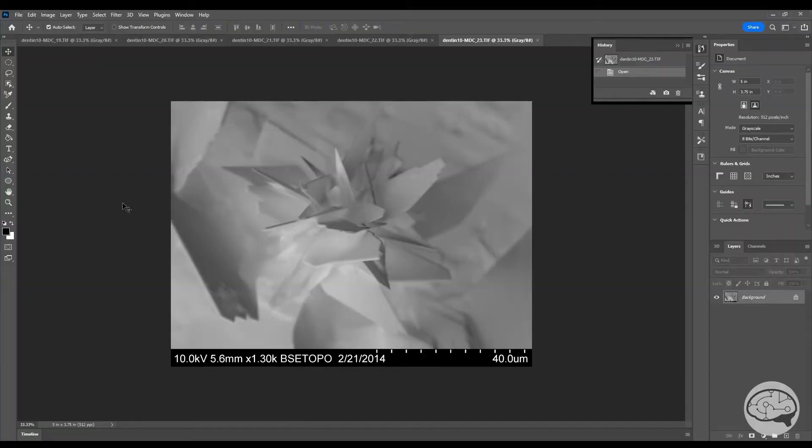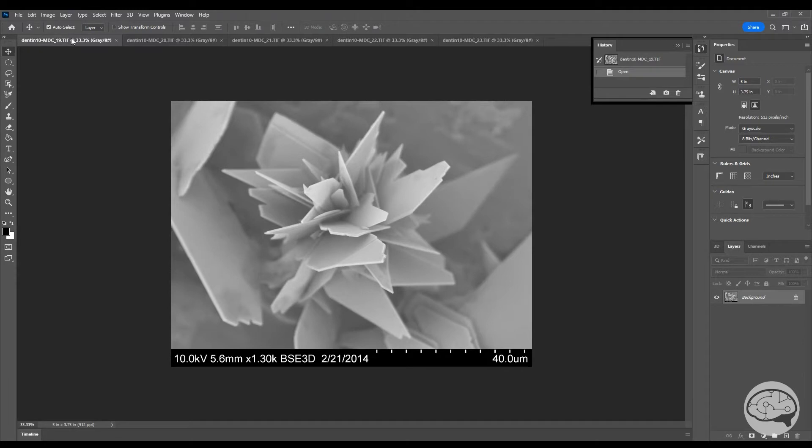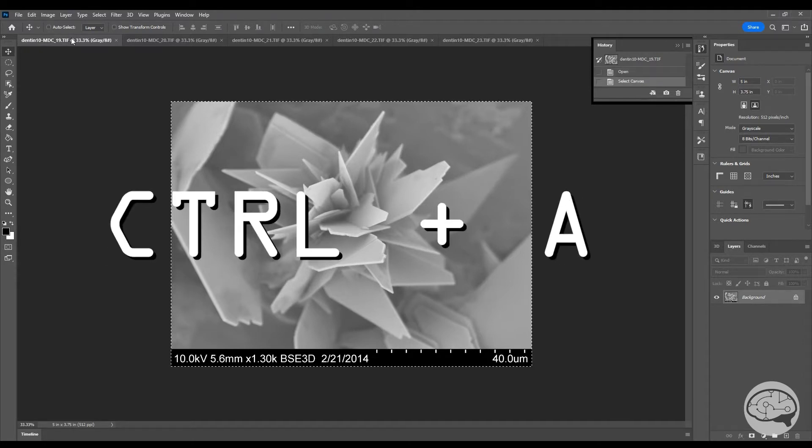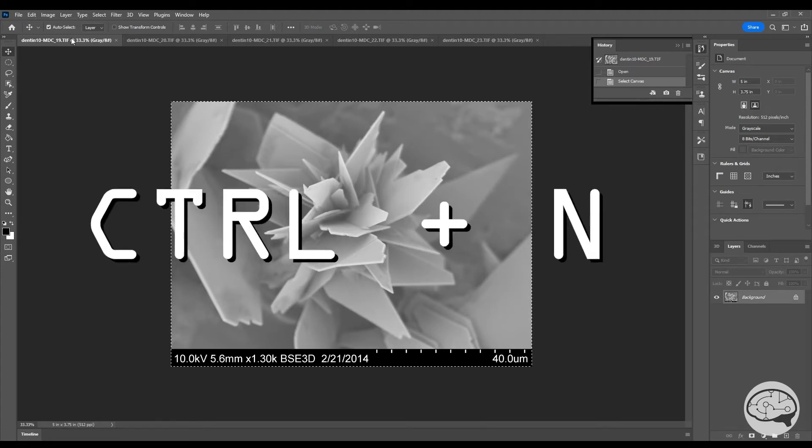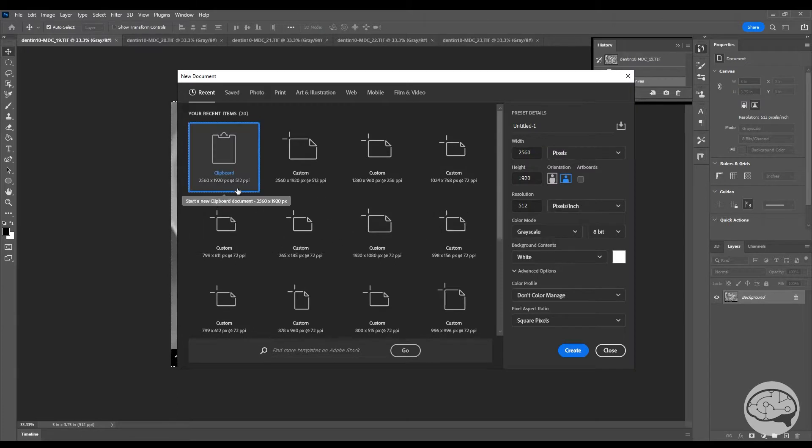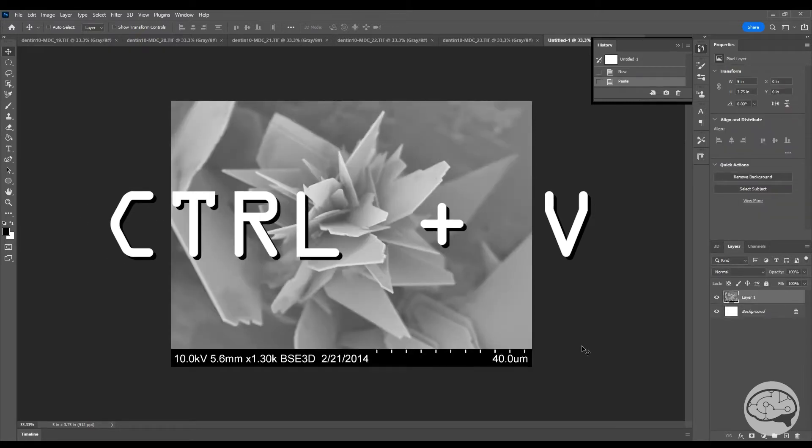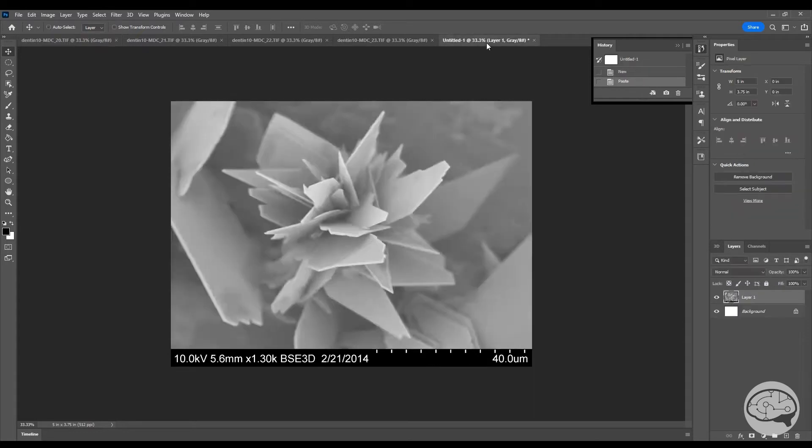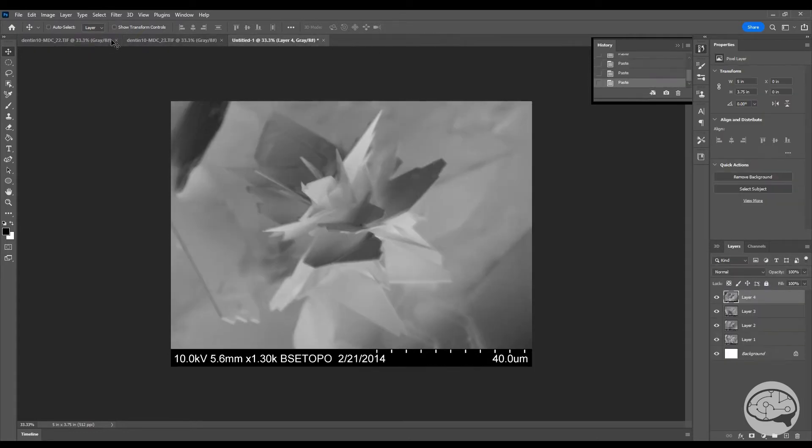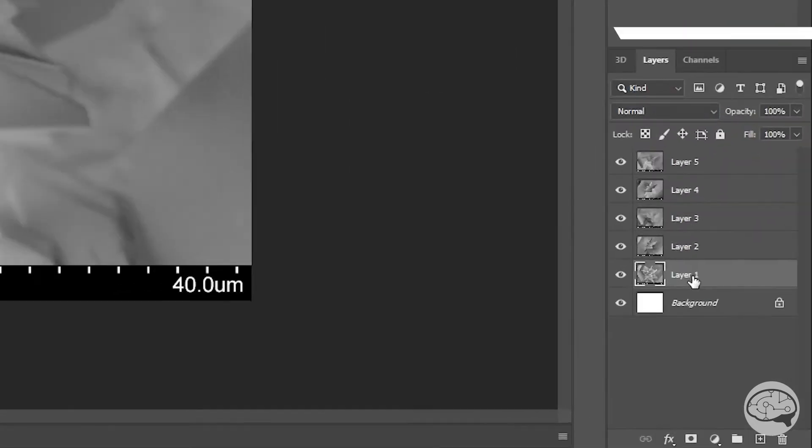We'll start by opening them all in Photoshop. We'll take one, it doesn't matter which one, and hit Ctrl A to select all of the image. We then hit Ctrl C to copy everything we've selected. Then we'll hit Ctrl N to make a new image. We'll make a new image the same size as the image we just copied onto the clipboard. We can then Ctrl V to paste the image there. We'll then select all and copy and paste all of our other images into this new file that we've made. In the end, we should have four to six layers over here. I'll label the master image layer so you can keep track of it easier during this video, but we'll also want this master image layer to be on the bottom of the other layers, but on top of the background layer.